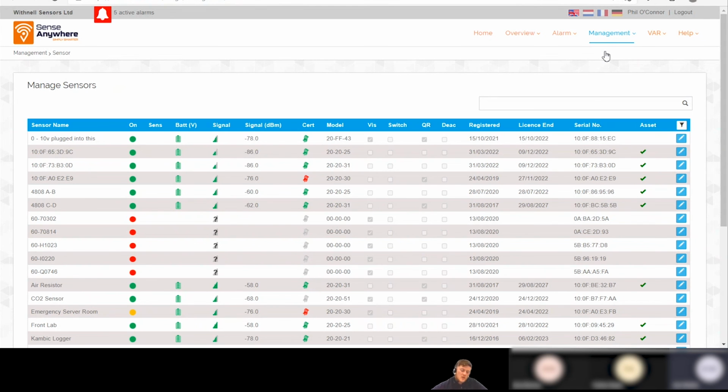That's fine. Yeah, no, but I mean, don't get me wrong. I can ask the question, but I think every time, because that question has come up a few times, it is just always a case of we need to be the ones that are calibrating it, not just for the monetary side, but on a quality point of view. Yeah, I understand it is a cost incurred that you like to preserve, and if you do it in house, then obviously that cost can be brought down. But it's just always been a rule that I know of that it has to be us from Sense.